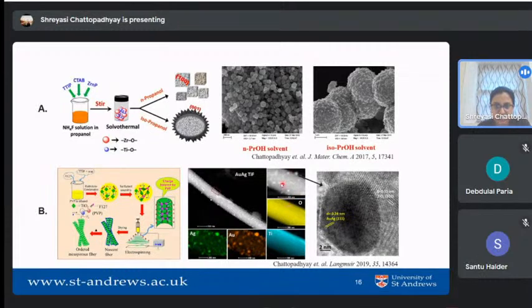This part is the normal image, and if we go for the elements, you can see Ti and oxygen coming from TiO2. And for the single nanoparticle, you can see it has both gold and silver. That means this nanoparticle is making an alloy.